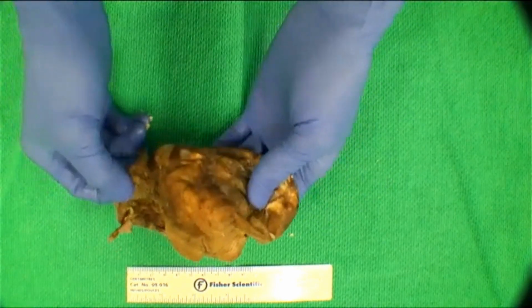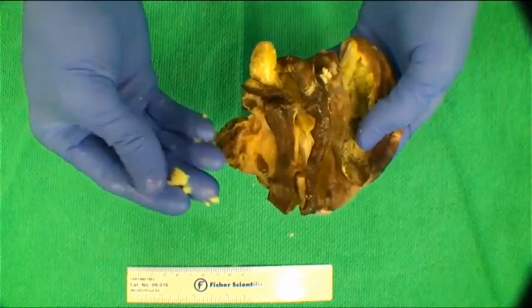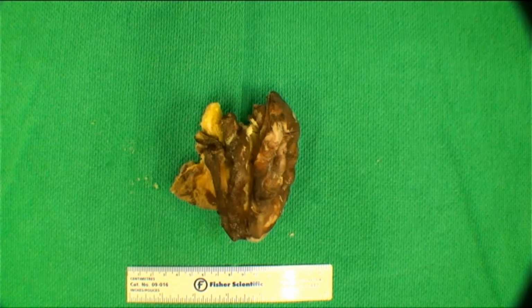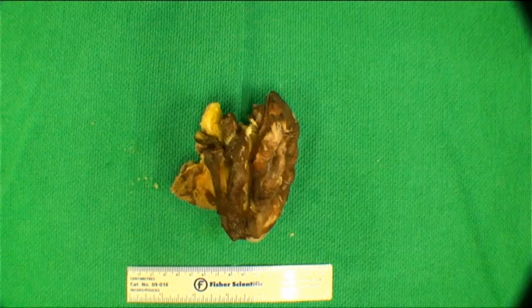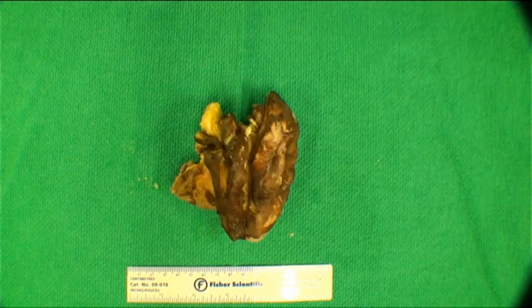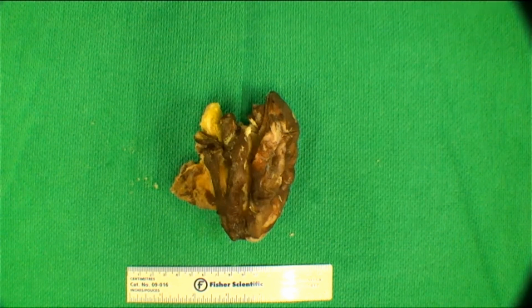Okay, so from there, obviously, some of the cyst contents you'll notice was that yellow, fatty, sebaceous, disgusting material. This is probably most people's least favorite specimen to gross. At least a number of the PAs here have expressed that position. So hold on, do you think if you poll PAs across, this would be one of the grossest, most disgusting and disliked specimens? I think, yeah. Unanimous, wow. Unanimously, everybody hates grossing these because they're just gross. They're not so bad when they're 4 or 5 centimeter specimens, but when you get the ones that come in a bucket that have a couple of liters of that yellow stuff. The sebum. Yeah, so it's very often filled with hair and it's gross.